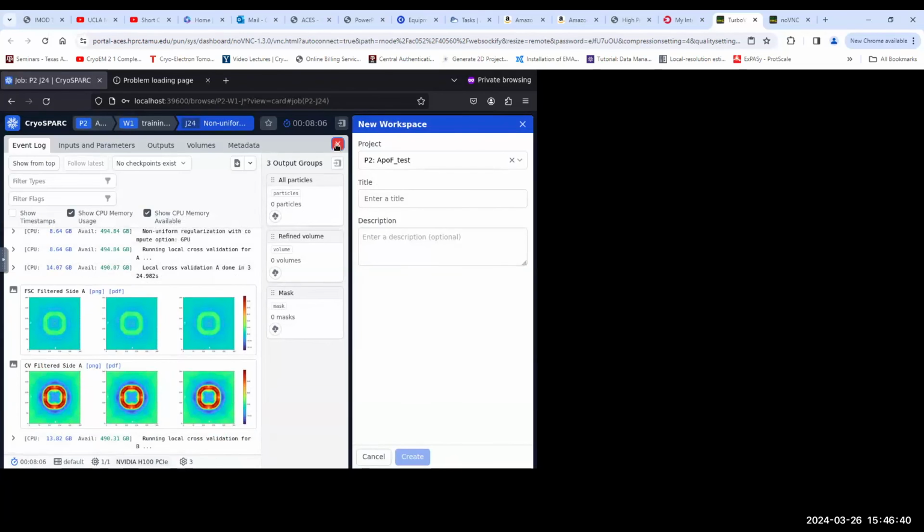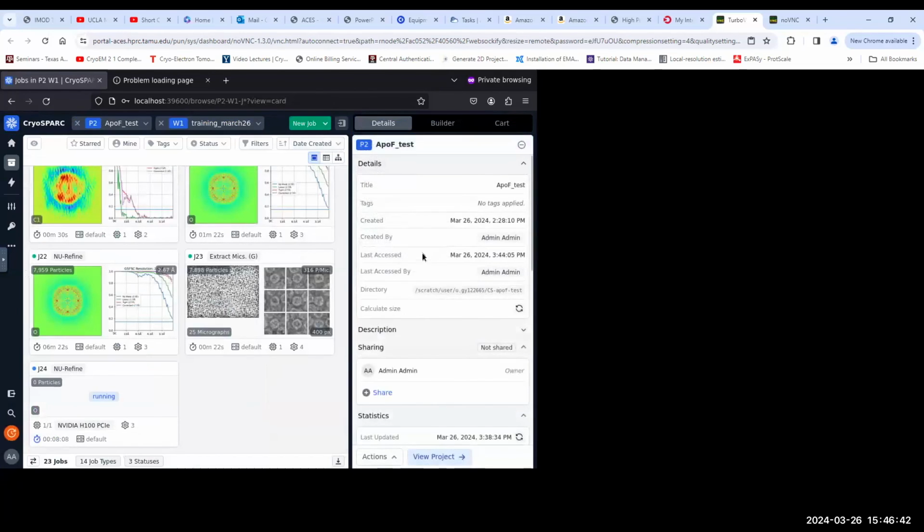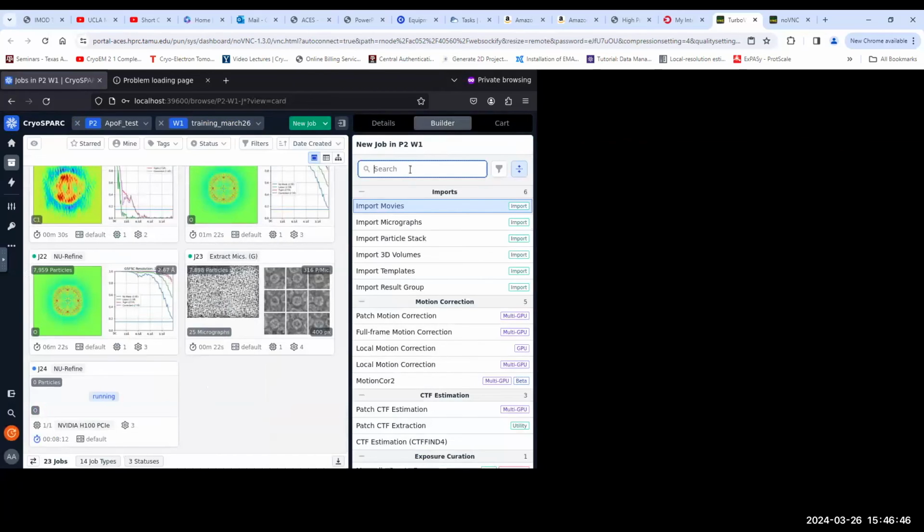What else you need is to verify. Usually if you look at CryoSPARC publications, they provide the map colored based on resolution.